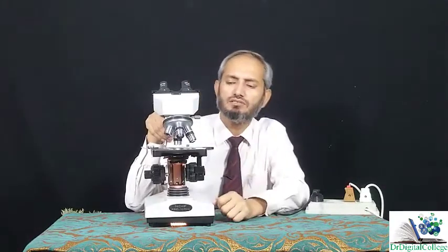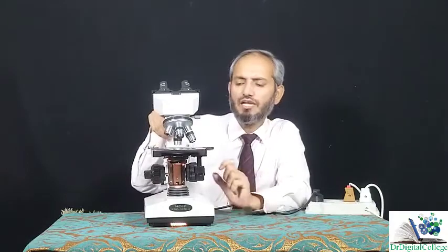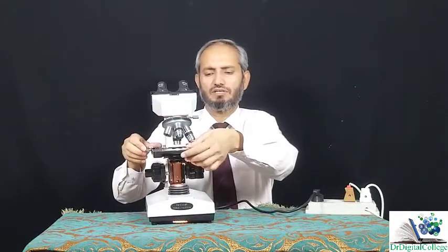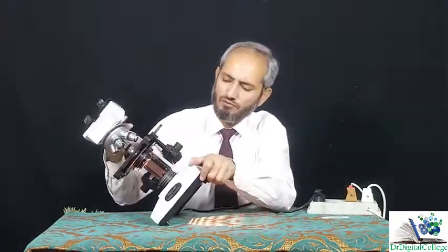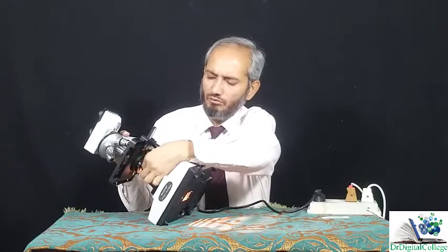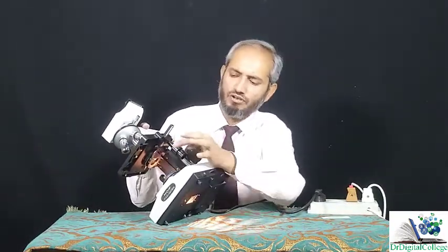Now we can use different resolutions. For that purpose, we will have to go below this stage. For the time being, I'm removing this slide. Okay, and now if you go to the lower side of the stage, there is one thing here that I am moving like this.